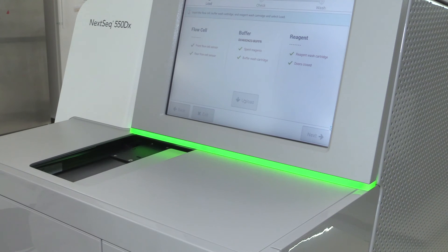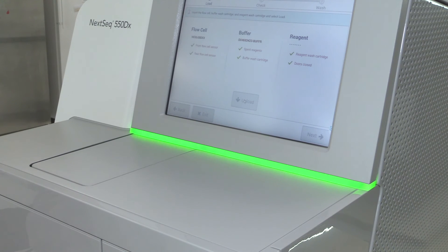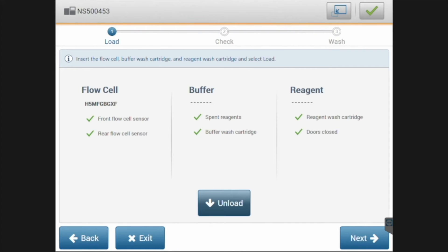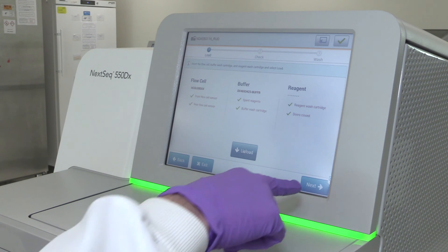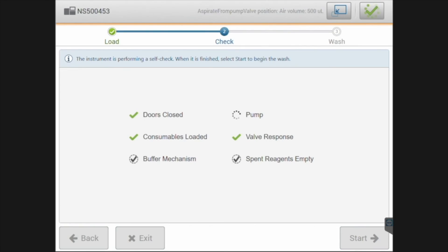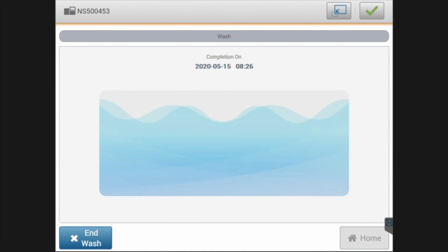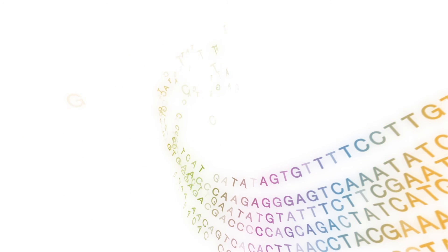If all ticks on the screen are green, please use the next button to access the wash. After the preliminary checks are complete, proceed to launching the wash by pushing start. You'll see an estimate of the wash completion at the top of the screen.